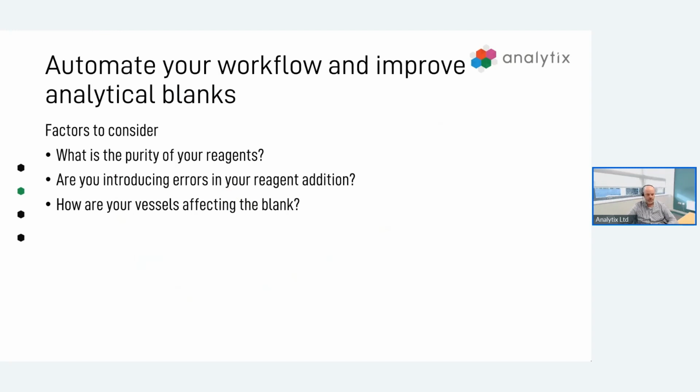In the world that we live in now, with regulations, with improvements to obviously the technology in terms of the analytical, it puts a lot more stress on the front end sample preparation procedures. So in here, we're going to focus firstly on the purity of your reagents and what impact this can have for you moving forward and getting a good quality digest with a low blank.